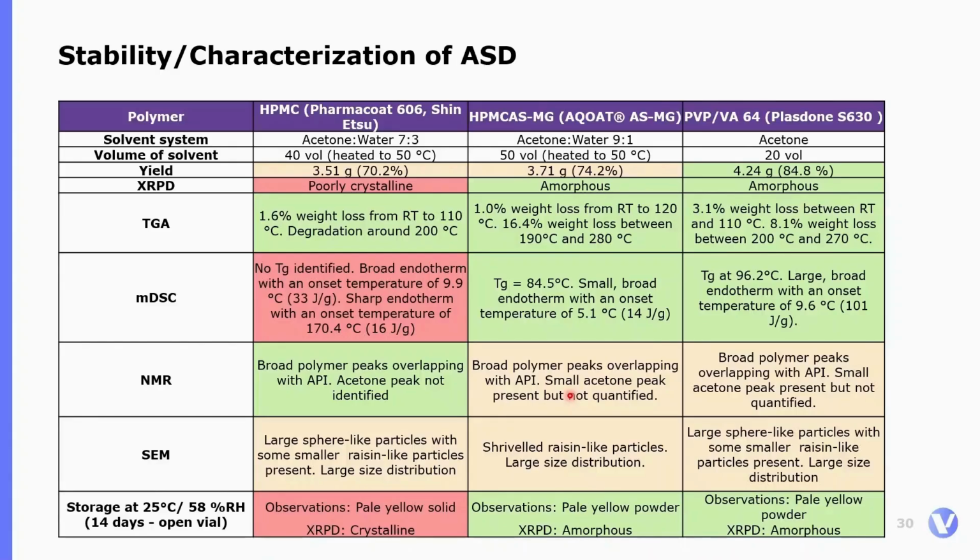To test stability, we exposed these dispersions to humidity stress for 2 weeks in open vials, and encouragingly, no crystallization was observed. Even more promising, after storing the sample in a closed vial in our lab for over 1 year, we did not see any sign of recrystallization.